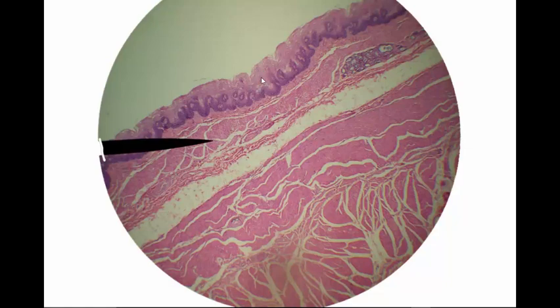The mucosa in this case is stratified squamous epithelium and its bottom is this kind of purplish line here. Under that we have submucosa. So that's the next layer, submucosa. And then lastly out here we have muscularis. The fourth layer of the alimentary canal is called serosa, but the majority of the esophagus doesn't have serosa because as it's running through the chest it's kind of deep in the tissues.